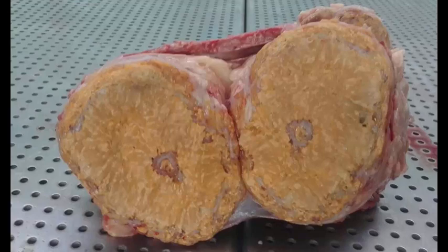You can find it in the lung, you can find it in the meninges. Very, very rarely you'll find it in multiple organs. So usually it's like one lymph node. But the characteristic exudate, in my mind, is pretty unique. And whenever I see something dry and crumbly, because remember, these are caseating granulomas with a bit of mineral to them. Caseous comes from the word meaning cheese, so it gives them a dry, crumbly appearance. Let's look at the foils.